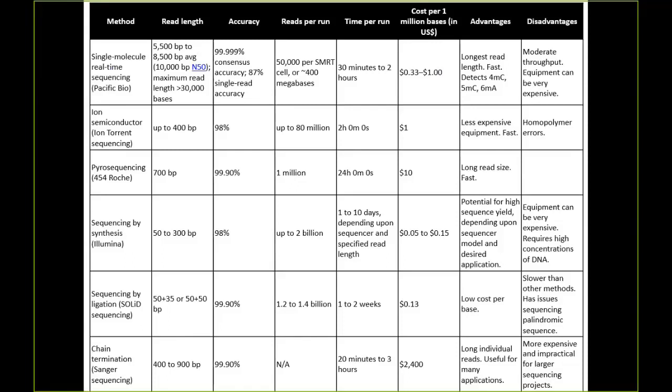I believe for any individual base call, there's about a 13% chance that the sequencer blew the call or called the wrong base. So if you're trying to do variant calling with PacBio, you're going to have a really, really bad day. Basically, if your sequencer is calling bogus variants more than 1 in 10 bases, that's going to get really awkward. And there are ways to error model around that, but you don't want to. Yeah, PacBio is just generally not good for trying to pick up these little sequence variants. I'll talk about it later.